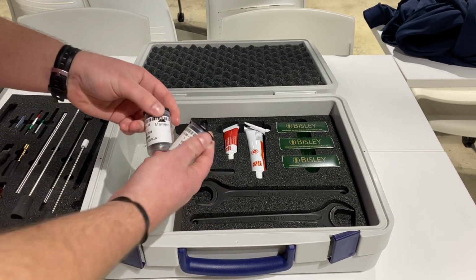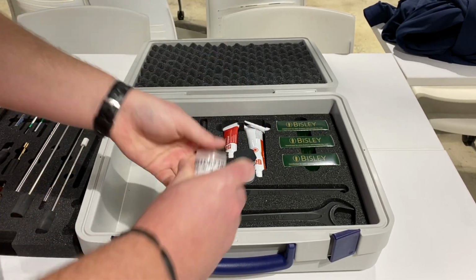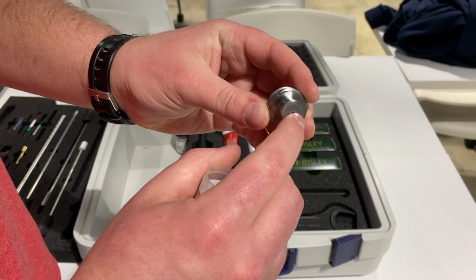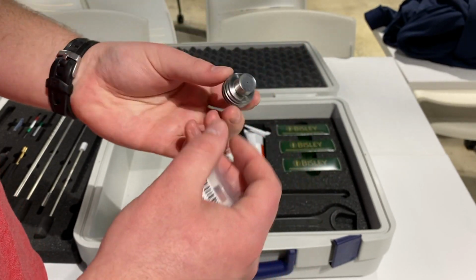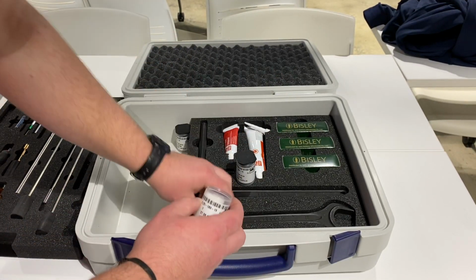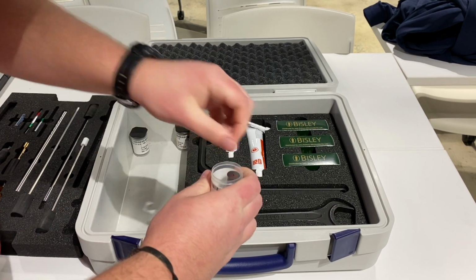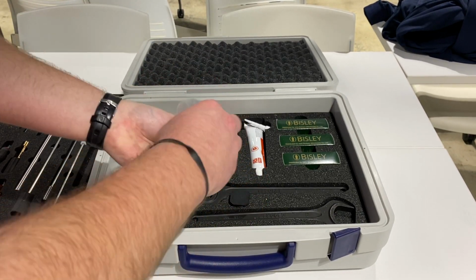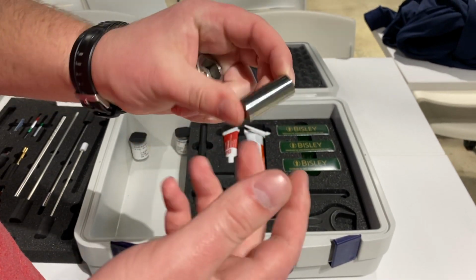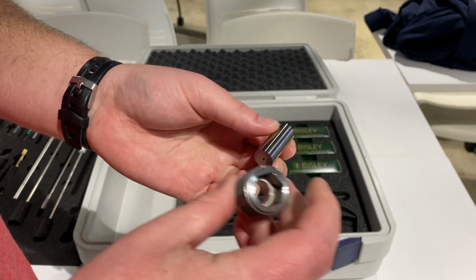So these are the two dies that we're not going to be using. This one's actually rather small. You can see that the die is inset in the die holder. The rest of them aren't exactly like that. Go ahead and pop that back in. Here's our largest die that we have. It's about an extra third of the length compared to the die that we will be using for this test, and this is its die holder.